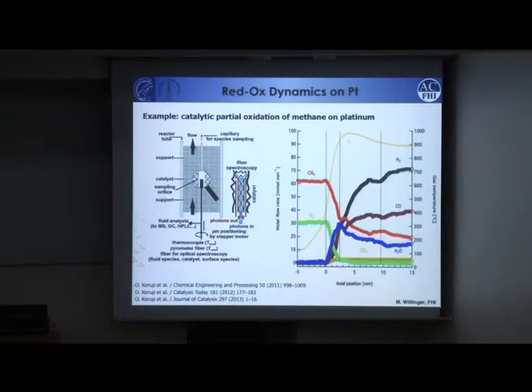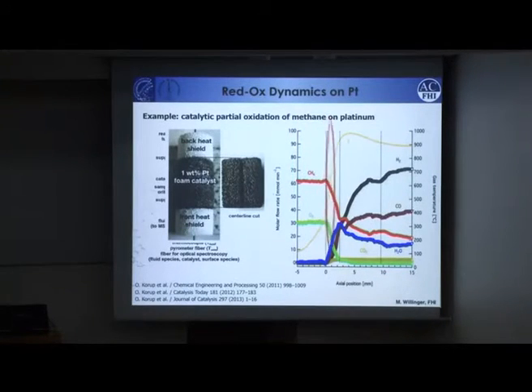And what I want to point out is when I usually do TEM on a catalyst, people do a reaction in a reactor, then you take some powder, I dilute it, I put some particles on my material, but I have no idea if it was here or here in the catalyst. But these particles up here, there's a completely different gas atmosphere than the particles down here. And there's a lot of dynamics, and if you study the whole thing, you don't understand it. So you have to go to a specific point where you know exactly your composition of the gas phase and look at the dynamics. And this we did in case of this platinum catalyst, not in this system.